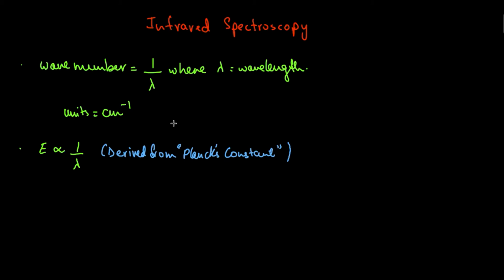Infrared spectroscopy is an analytical technique that is used by professional chemists to separate, purify and primarily identify the analytes of an organic compound. What we mean by that is that the functional groups present in the organic compounds are identified by various factors. We will be discussing that in later slides. But for now, let us understand the functionality behind which an infrared spectroscope is able to work.